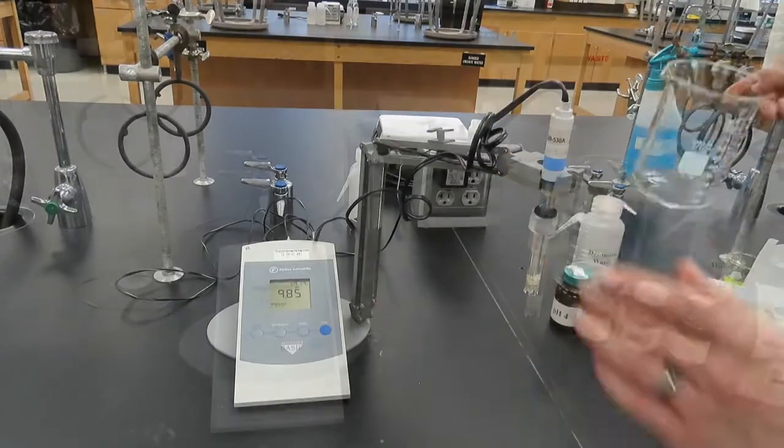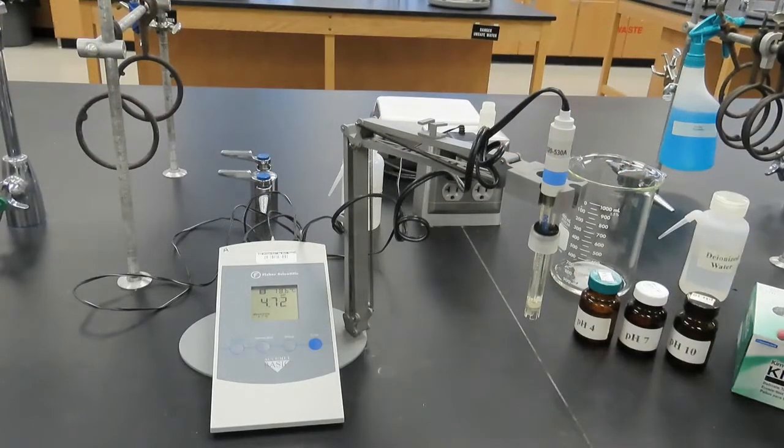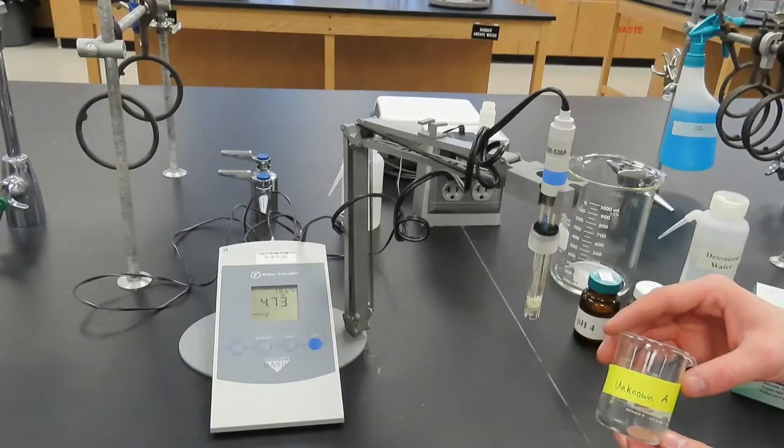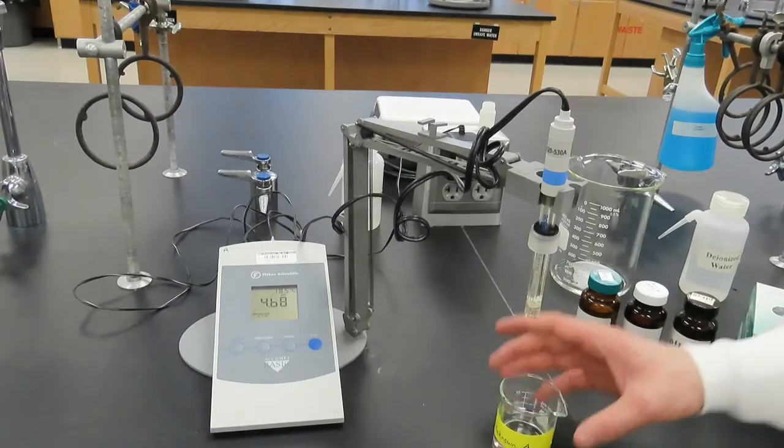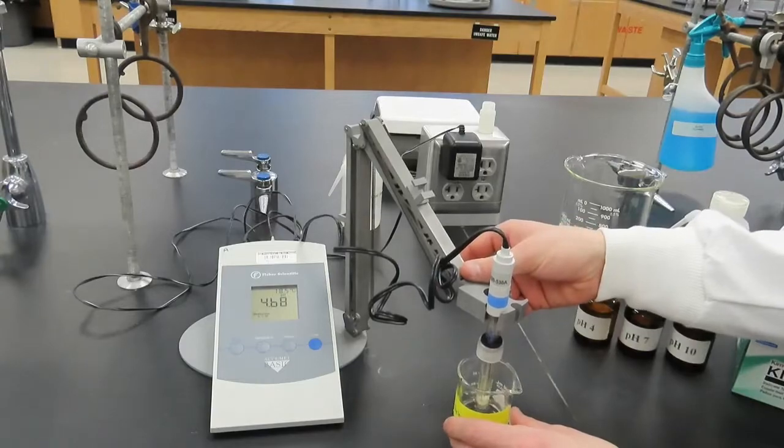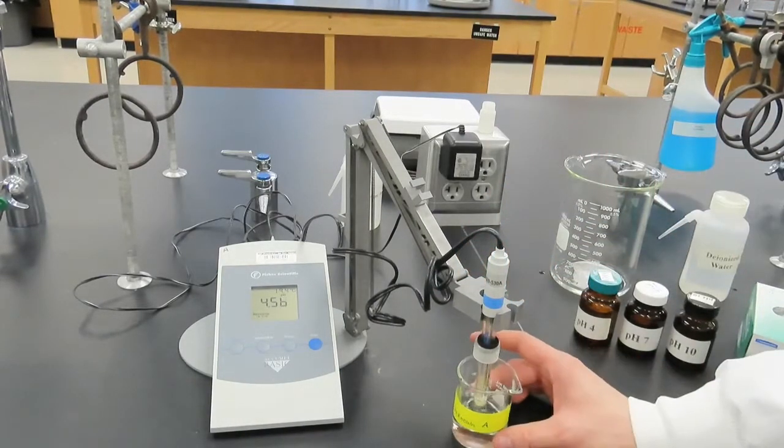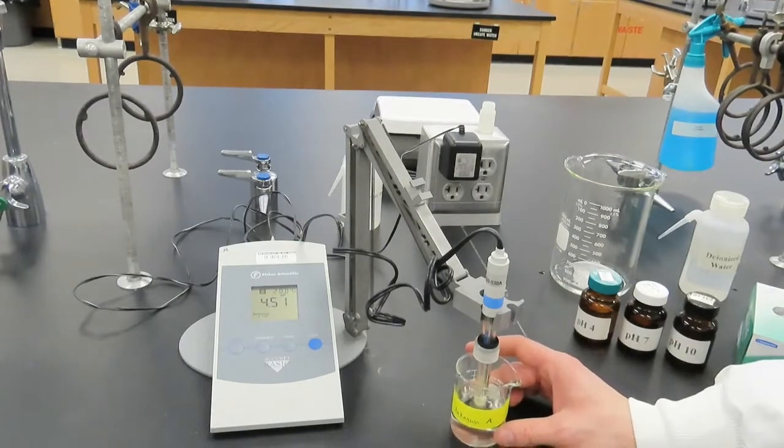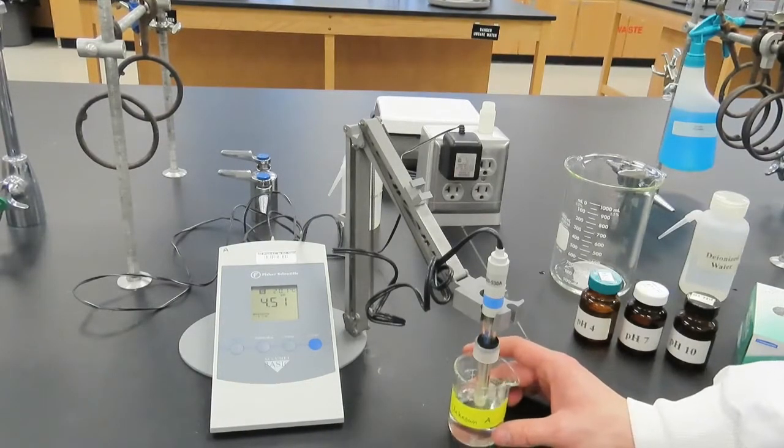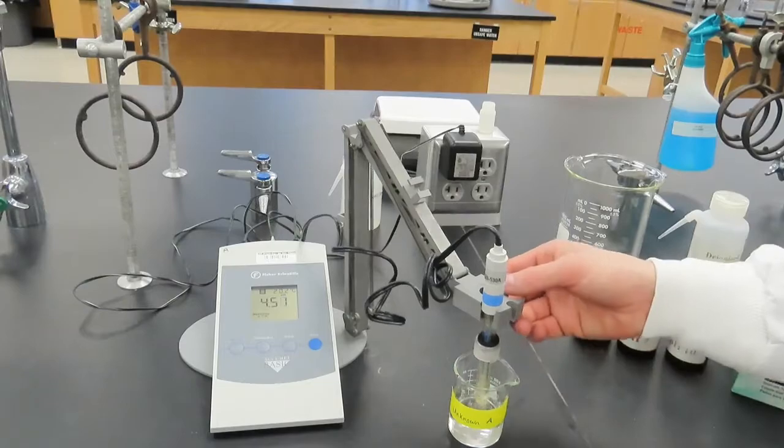The pH meter is now ready to measure the pH of solutions. We will first measure the pH of solution labeled unknown A. We'll immerse the pH electrode into the solution and swirl. The pH value when the display stabilizes is the pH of the solution, approximately 4.51. We'll remove the electrode from the unknown A solution.